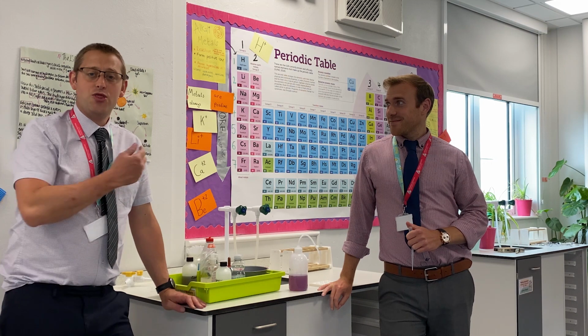Your teacher should have had some equipment delivered to your classroom, which you will be using today. This lesson we're going to be looking at pH and acids and alkalis and indicators.